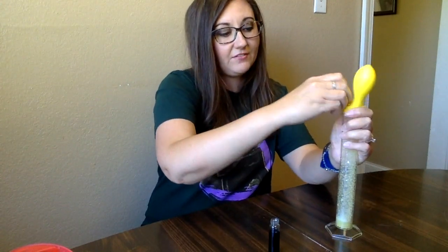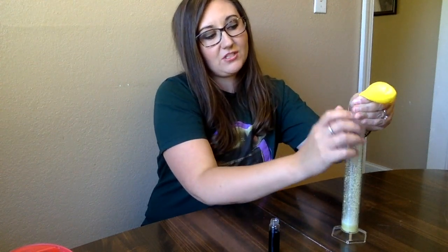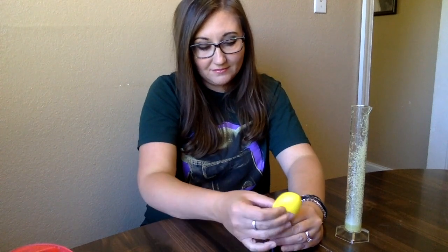I'm going to very carefully take off my balloon here without losing too much of the gas, and I'm going to put this over my little test tube, and we're going to leave it for a while and come back and see what happens.